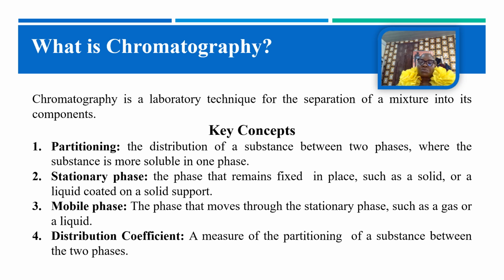We have different types of chromatography, but we will be treating paper chromatography, used to separate different dyes, pigments, amino acids, etc.